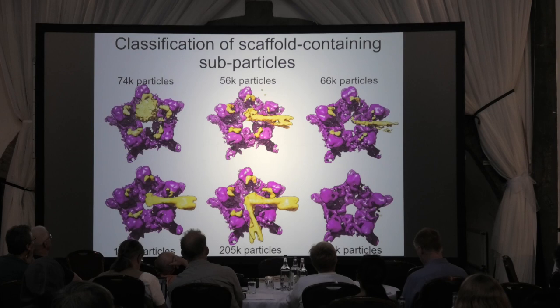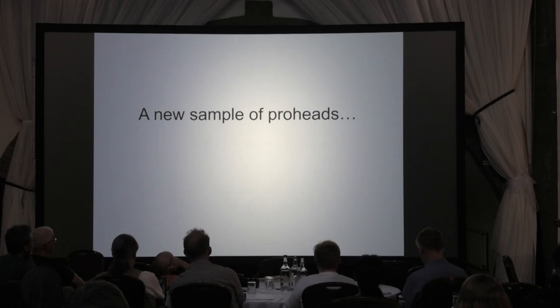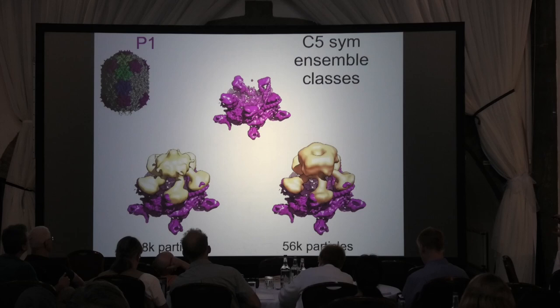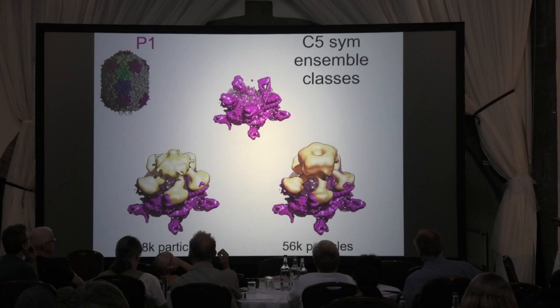I will go into more detail on this figure, but first I'm just going to try to introduce all the structures we have, and then we'll analyze them afterwards. So, a totally different, not totally different, another batch of prohead prepared independently. I wanted to gather up more particles so I could classify them more thoroughly. I had the idea to check the different pentons to see if there were different structures on the different ones.